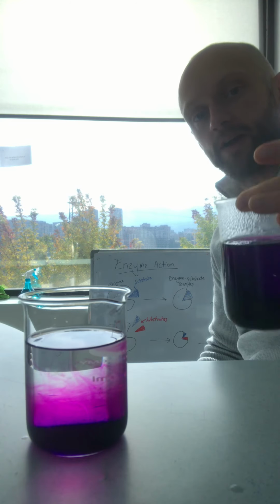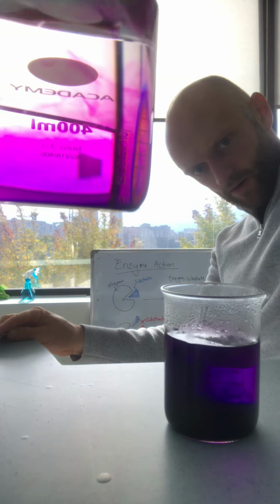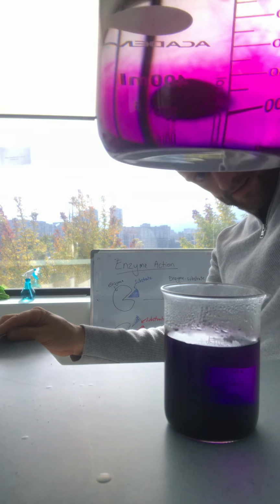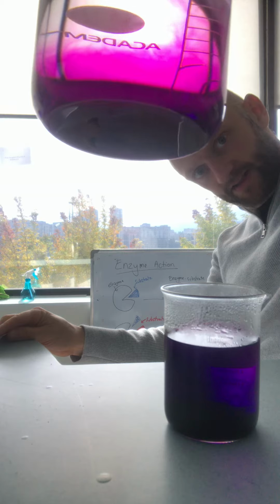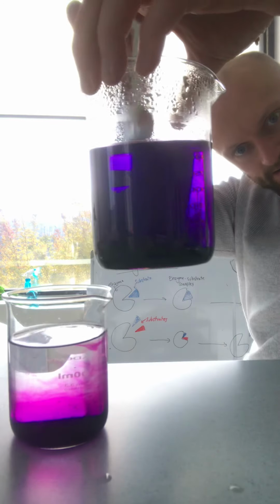Cheers. I'm not actually going to drink it. It's something that you can drink, but I really don't recommend it. But it's a gorgeous colour. Look at it. There you go. It's all mixed in, but it's mostly settled at the bottom. Whereas these, having much more energy, have been able to mix far more easily throughout it.